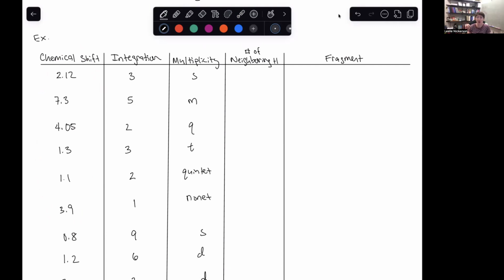If you have a lot of electron withdrawing groups nearby, it's going to start shifting it possibly downfield outside of the box that is provided. So a little bit of wiggle room on all of those is wise, to account for any discrepancies from stacking up a lot of electron withdrawing groups nearby and having a de-shielding effect going on.